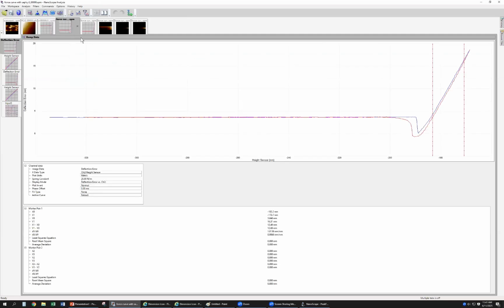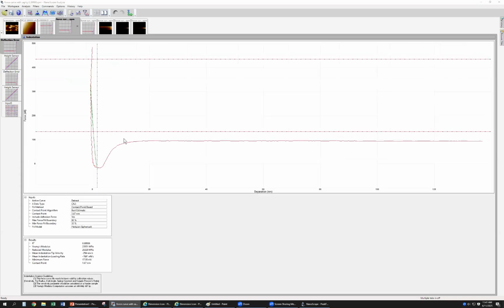So for example, we use this one. We use this one. See. So you see, this one is already here. Here should be the 0, right? Here be 0. The depth is around here. That means you do not need to change your sample.